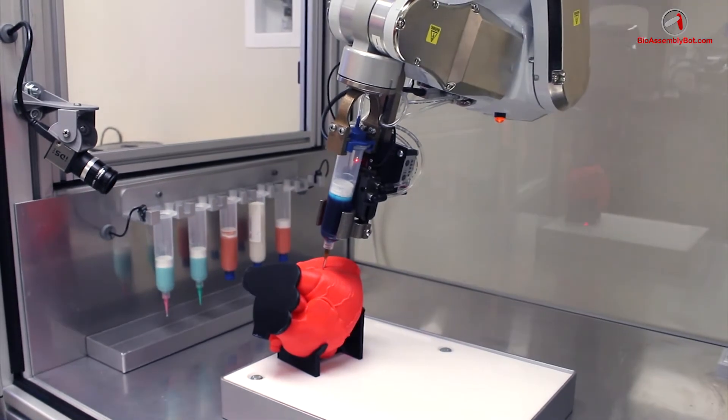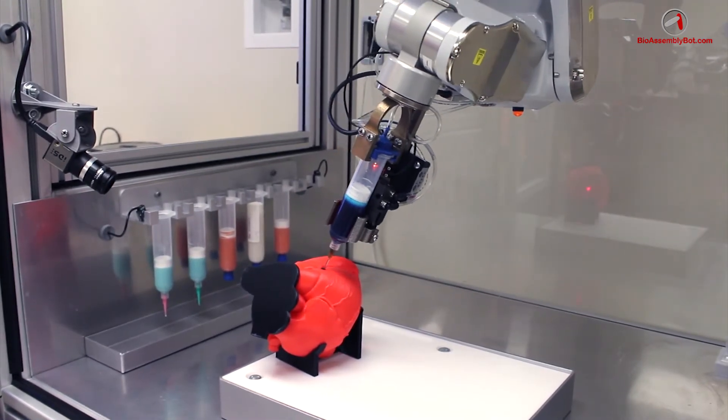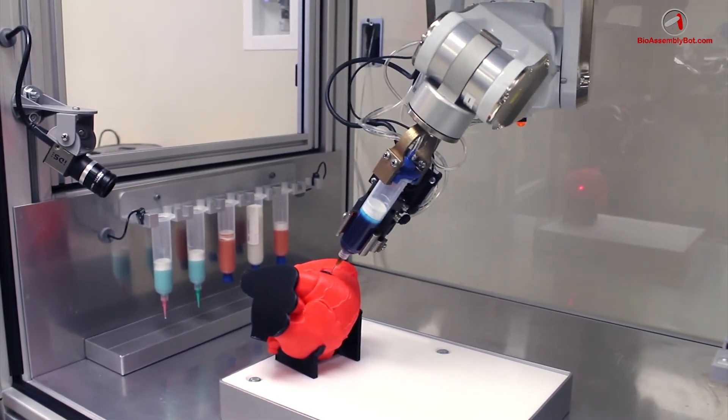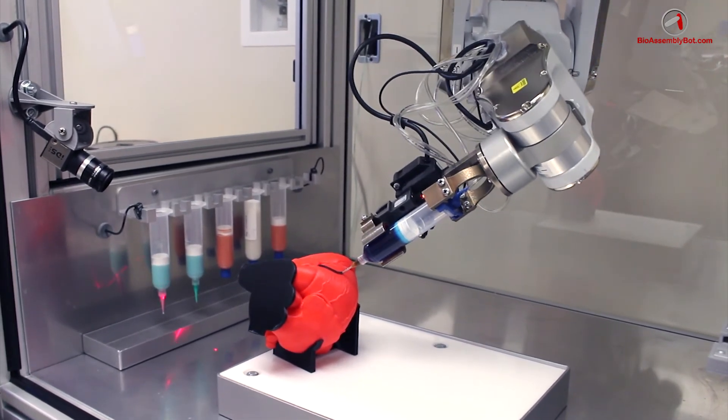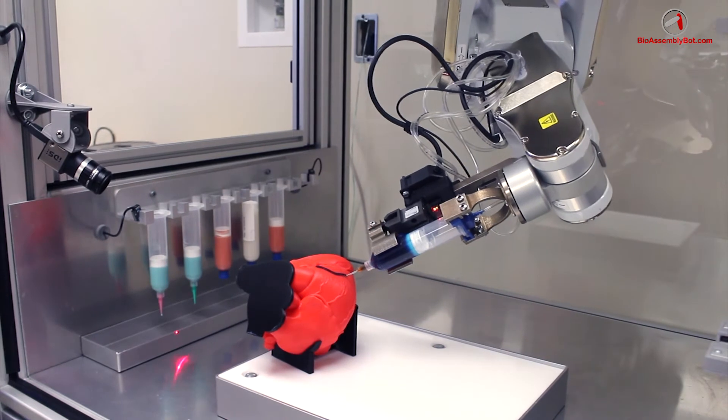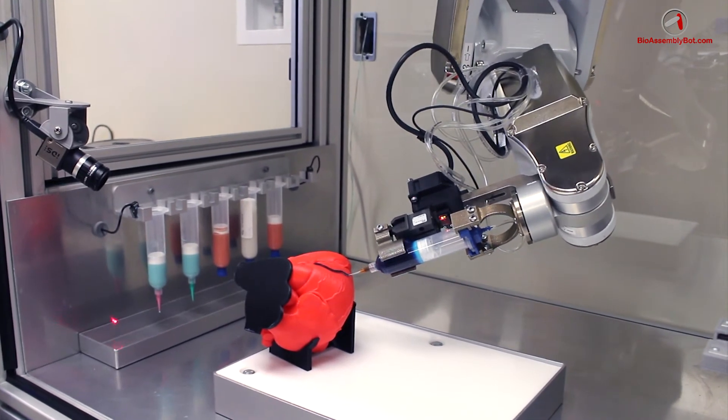Once the print is confirmed, the robot then begins working off of a pre-constructed heart model, and the vascular tree is now added to the surface of this heart model using the BioAssemblyBot.